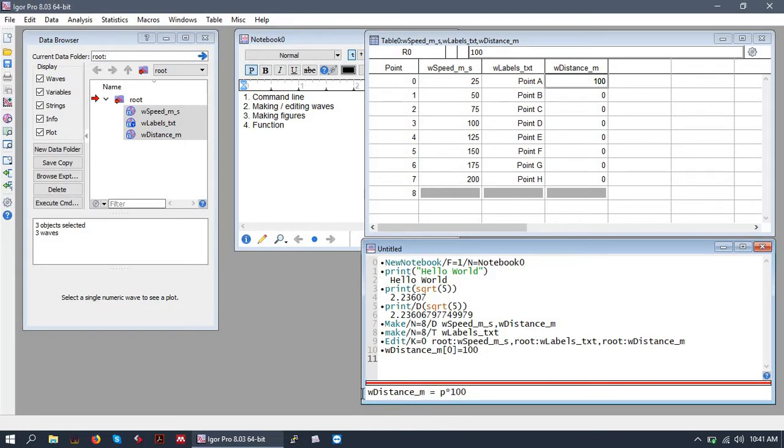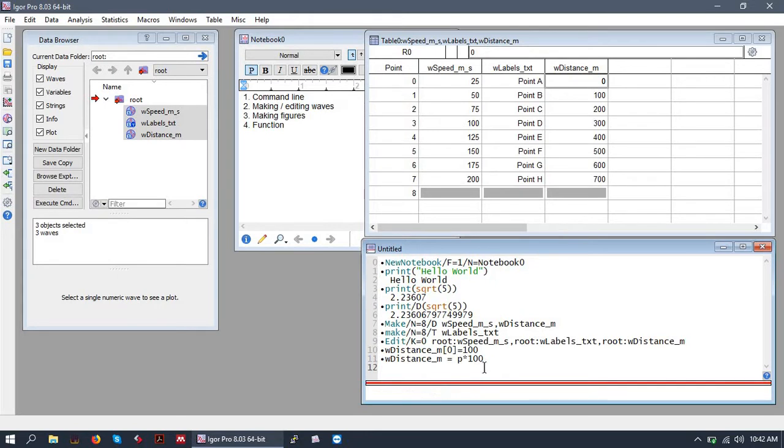So that seems confusing but let's just type this example out and it'll be clear. So we're saying the distance wave set equal to P times 100 at all points. So let's go ahead and do that and there we go.